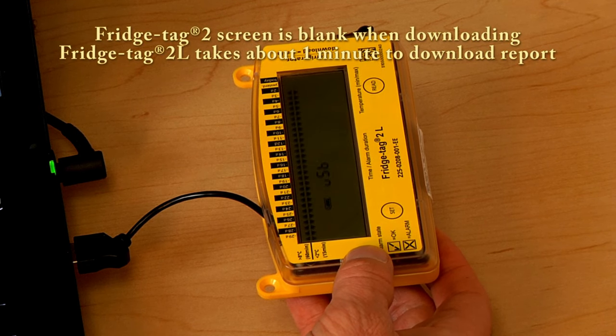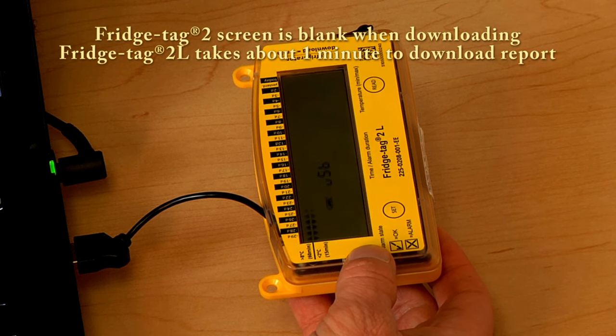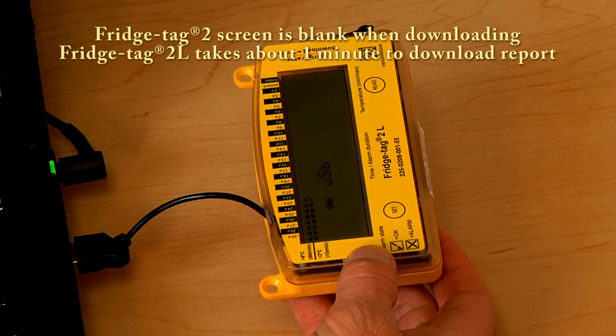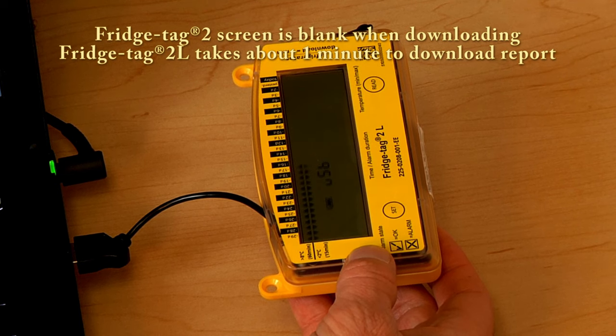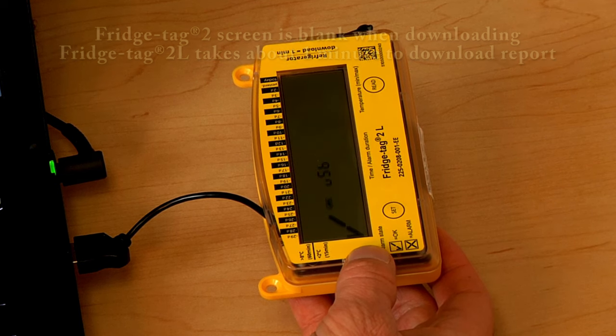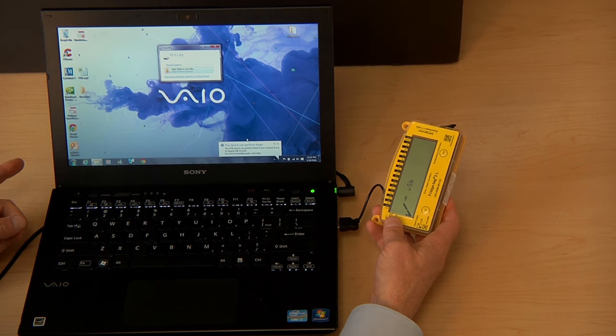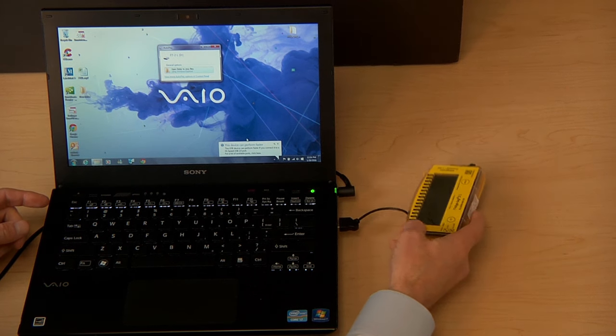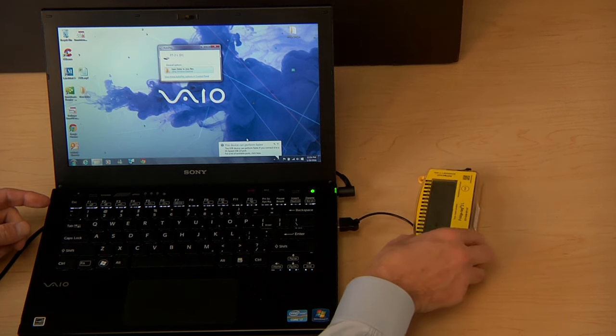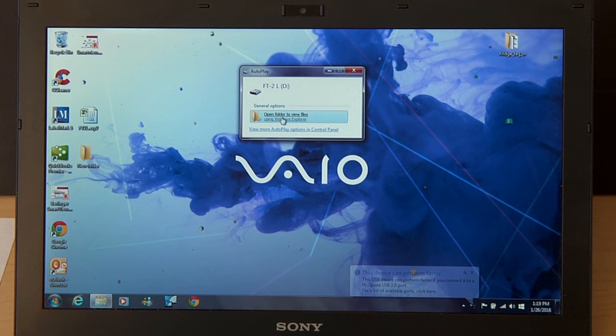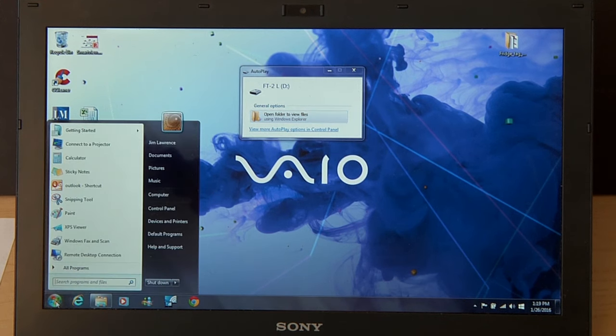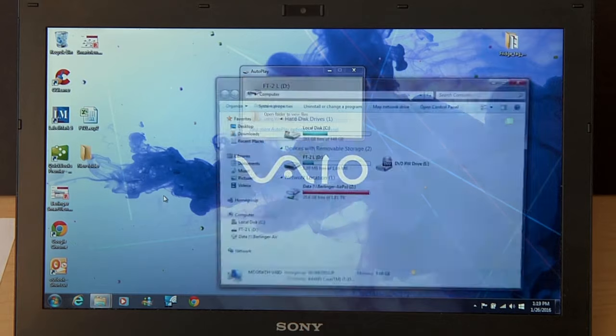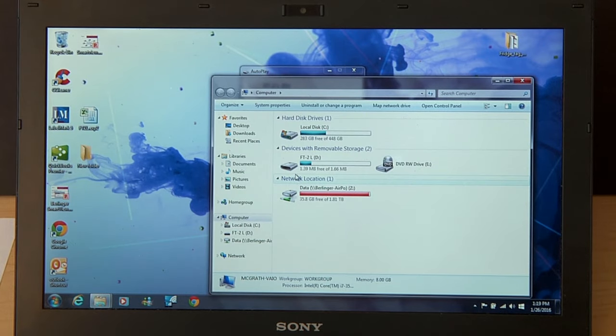When the Fridgetag 2L report is complete, the screen will move to a check mark, and the report will appear on screen. If the file is not on your computer screen, go to your Start menu, click Computer, and you will find it here with your hard drives.